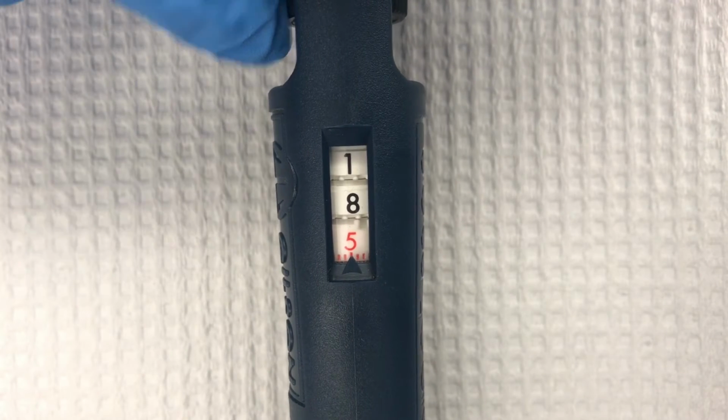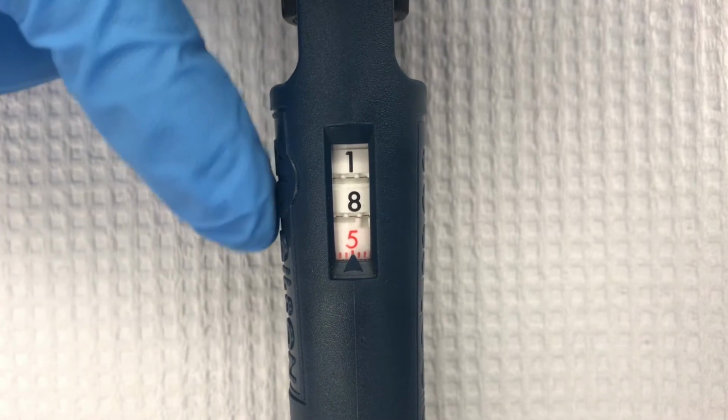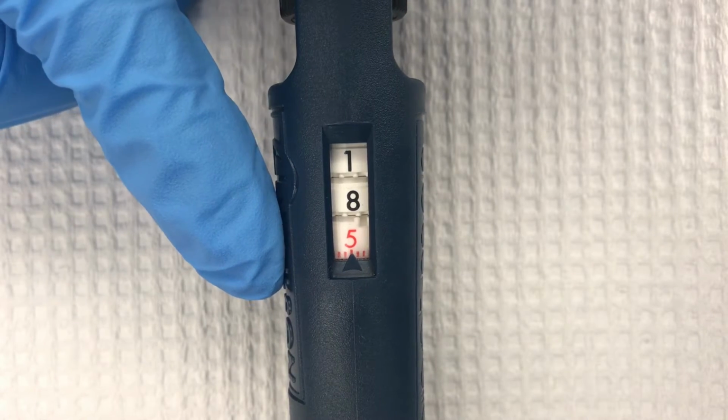This is a P20. The upper digit corresponds to the tens place. The middle digit corresponds to the ones place. The red digit at the bottom corresponds to the tenths place. This pipette is set to pick up 18.5 microliters.